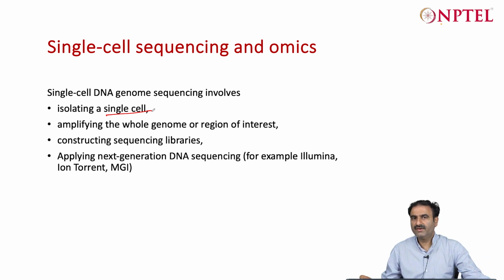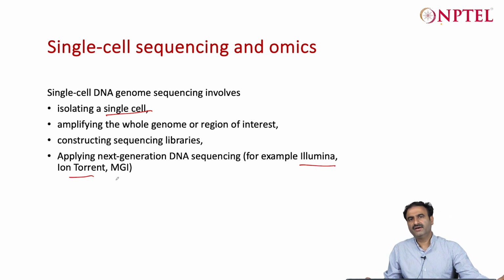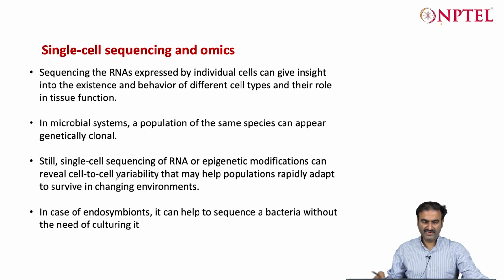But some of the modern methods can also go for direct sequencing of those DNA fragments or RNA fragments, right? So Illumina, Ion Torrent, MGI, even PacBio or Nanopore can also be used for the sequencing.